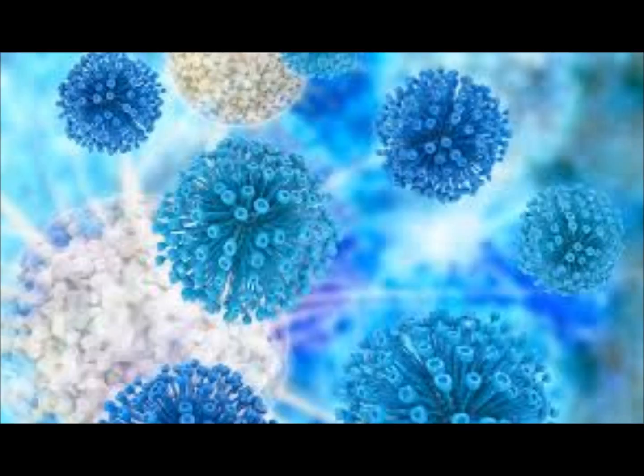You look for squamous epithelial cells. So you know how in urine we had the big fried egg appearance? You look for them on your gram stain. It's a system they call the Bartlett's, and if you'll notice on your gram stain sheet, look at what it tells you to do for sputums.